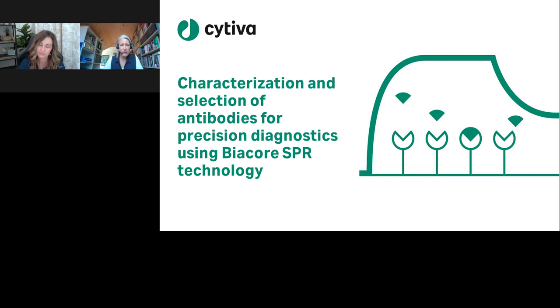So this is a very easy way if you want to get information on this. Test the binding as the functionality of your antibody with the antigen, which should be tested in your lateral flow assay, and then just vary the condition. Whatever additives you need to test, you can add them and observe if they influence this specific antibody you aim for. Or you could set the conditions you want, for example in your running buffer already, and then screen your antibodies under such conditions. Then you can directly identify which might be the ones which will work later on in your test kit.